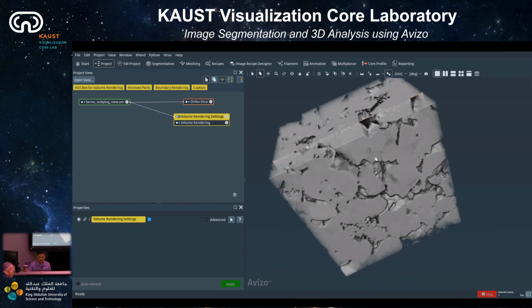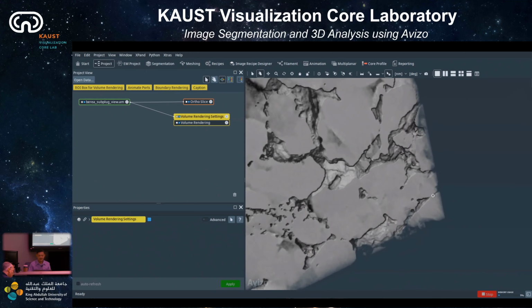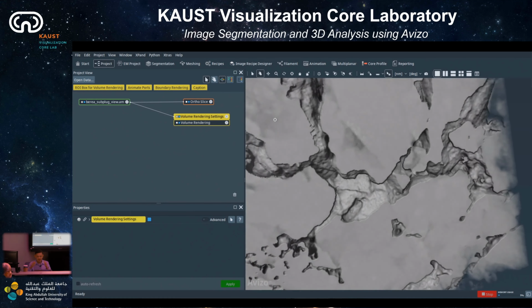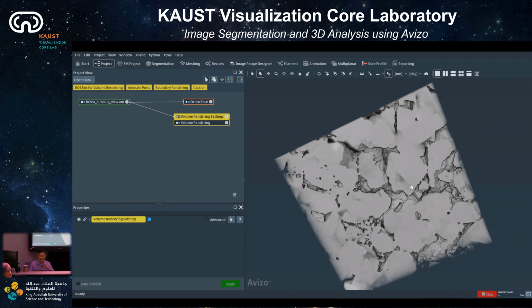And then we have the seek. You can see the icon here. If you click on seek, the seek will appear. If I want to zoom in at this region, at this point, you can click. You start to see that it zooms in at that point and recenters. If I do one more time, seek somewhere here, and click, it will zoom in and recenter the object to where you seek. This could also be useful if you want to create some nice animation.